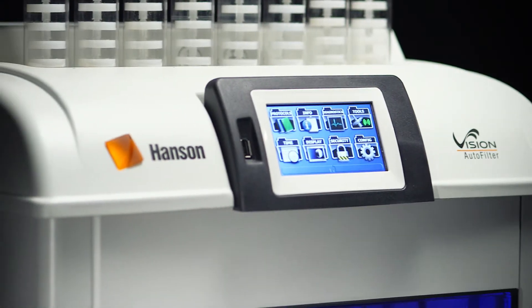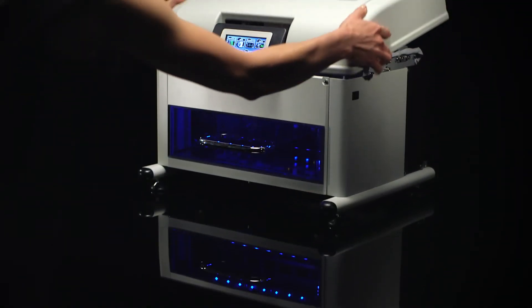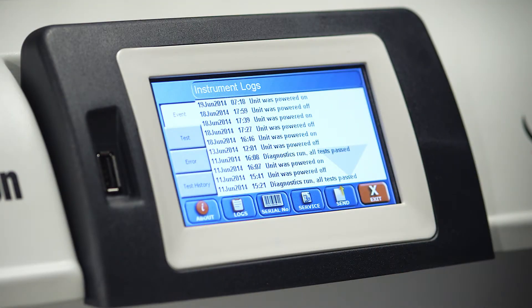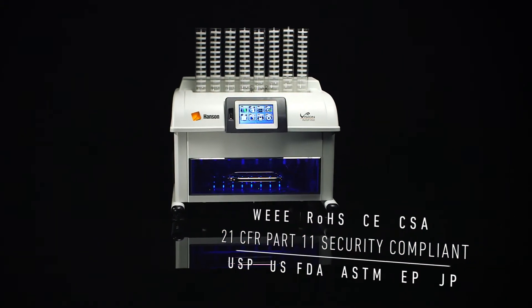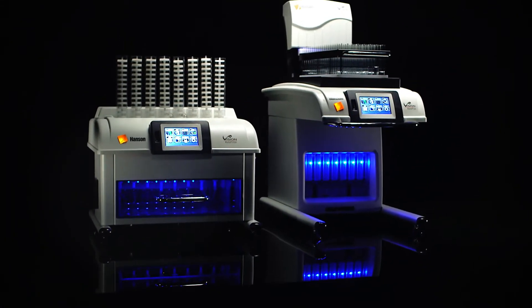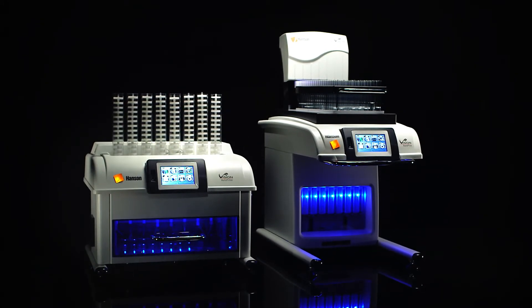Use a USB drive to archive methods and transfer them to other Hanson instruments. The Vision Auto Filter Changer is designed for easy serviceability and maintenance — pop-off panels provide easy access, and emailable log files make for easy communication with technical support. The modular component design allows for easy plug-and-play, putting power back in the user's hands.